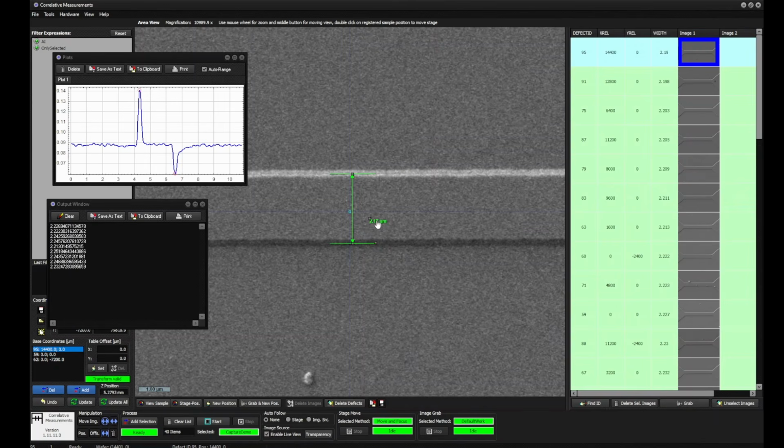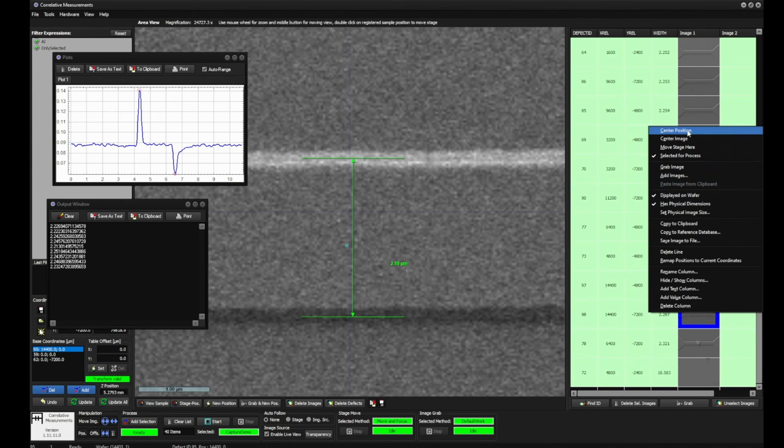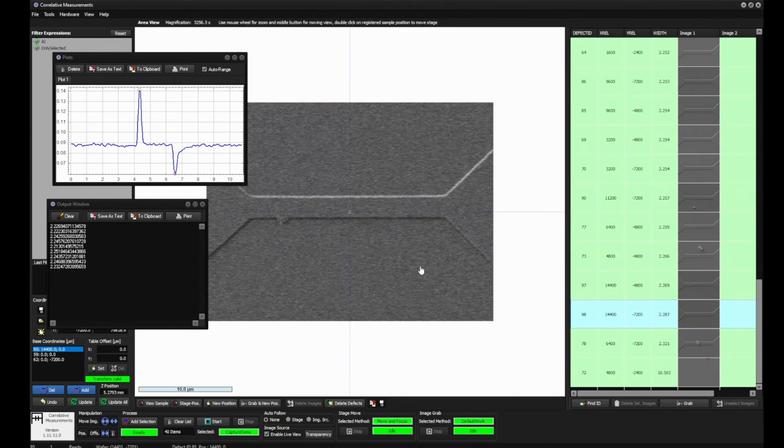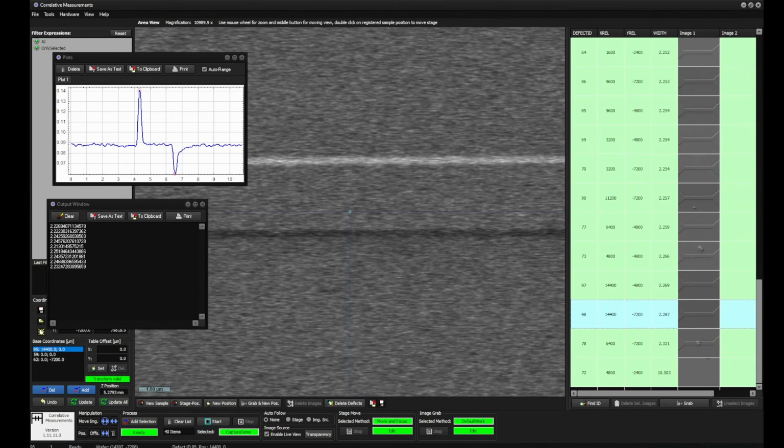So this is 2.17 when I measure it by hand. It's a little bit off, you see, 1 pixel. One has to zoom quite far in. If you take the middle of this, we are at 2.19. And when we go to this one here, which maybe this bulb has changed something, this should be wider. This is 2.28.